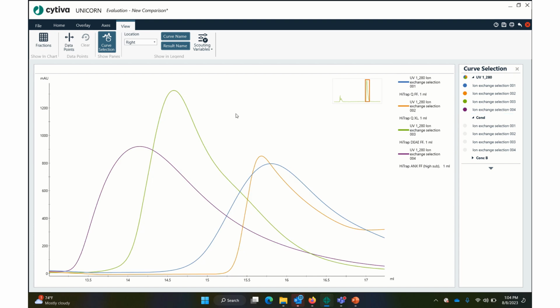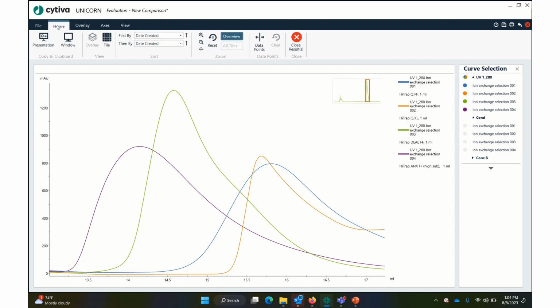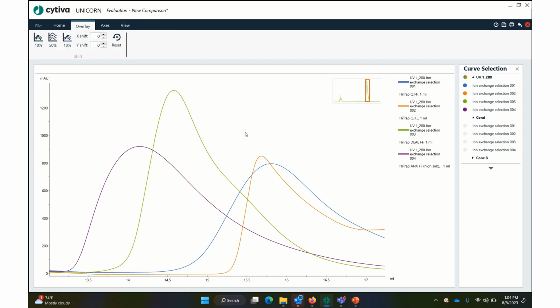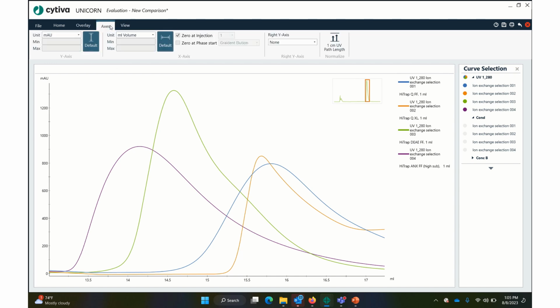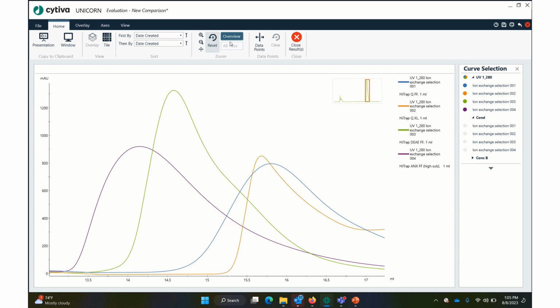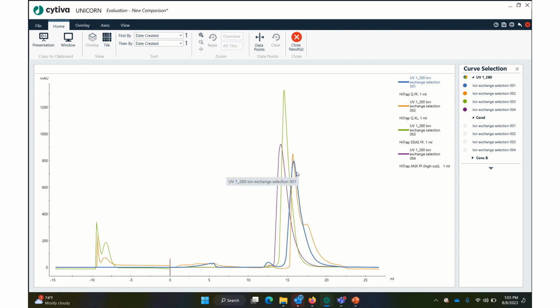Oh, wait, what am I looking at? Yeah, that's the primary peak. Hey, sometimes the zoom in can really get you. I'm used to just being able to right click here and hit unzoom or reset. Where's the reset? Curve axis. There we go. Sometimes I struggle with this. Reset. There, that reset. Okay.